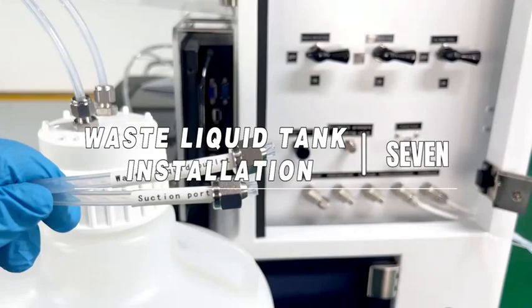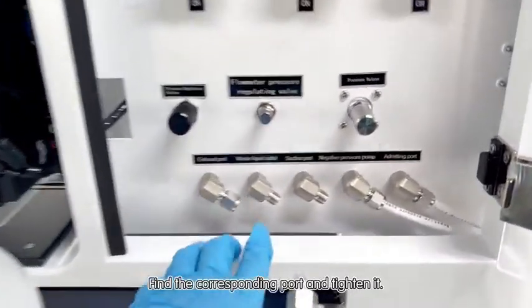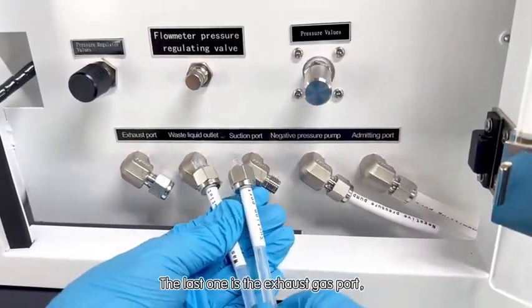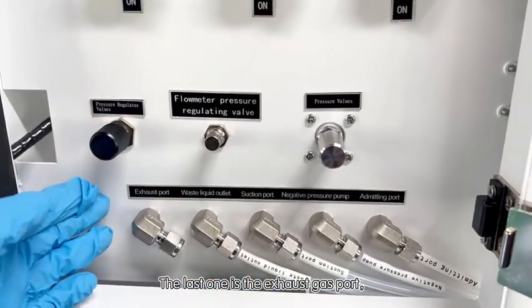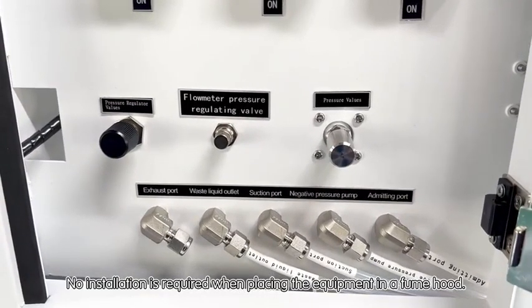Waste liquid tank installation. There are two ports to be installed in the tank. Find the corresponding port and tighten it. The last one is the exhaust gas port — no installation is required when placing the equipment in a fume hood.